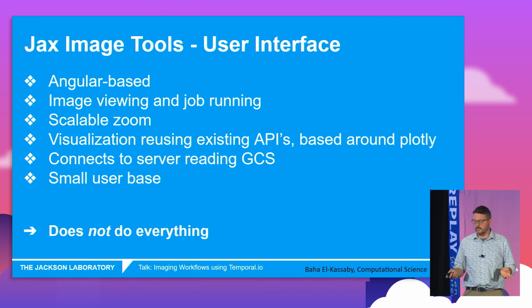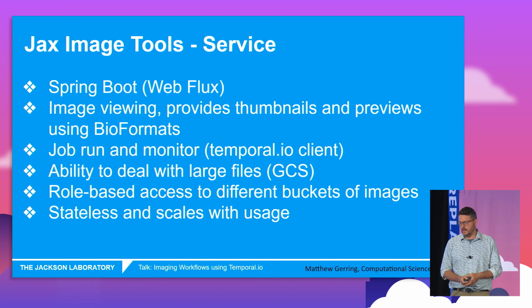It basically connects to the server and has a relatively small user base, so a large number of users is not an issue for our product. And it intentionally doesn't do everything. There are many image analysis front ends for selecting data and changing filters and all this, and everyone's got their own favorite one. So we're not trying to reproduce that. We're just trying not to repeat ourselves in all of these tools that we're deploying in Temporal by making a single web front end. And then the back end itself is doing that Google Maps-type ability, where you use a library called Bio-Formats. Has anyone heard of Bio-Formats?